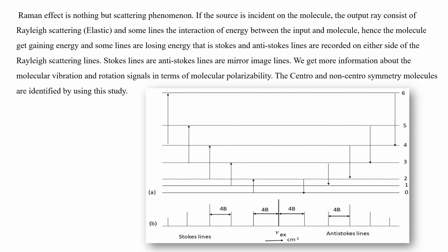Some of the excitation lines commonly used, such as mercury as an excitation source in the earlier days. When recording spectra with that excitation source, the spectra took a long time to record. So you have to replace the excitation source with a laser, giving laser Raman spectra. With the laser, the recording time is very short, and many spectra can be recorded.